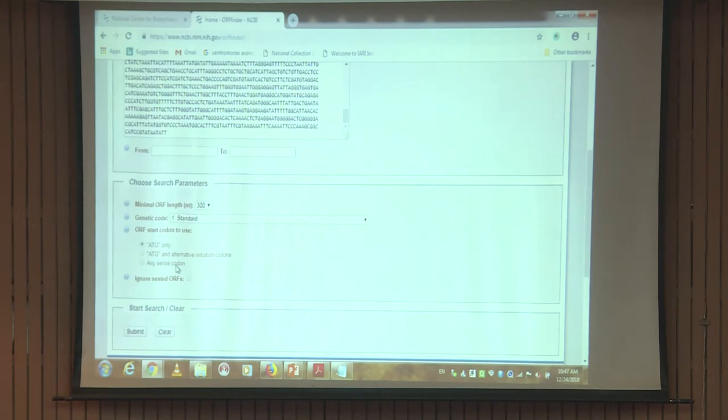Because in our plant viruses we often come across cases where the genome is first transcribed as a big RNA molecule and then a polyprotein is produced. So there is no particular start codon for any gene. But if you know that for this gene they use this particular nucleotide as a start codon, then you give that start codon in your sequence, and it will find where in the genome that start codon is present. Is that clear? Especially for the virology students sitting here.